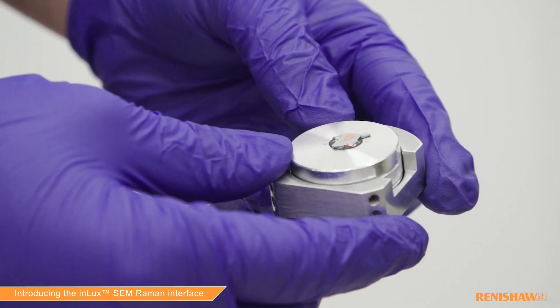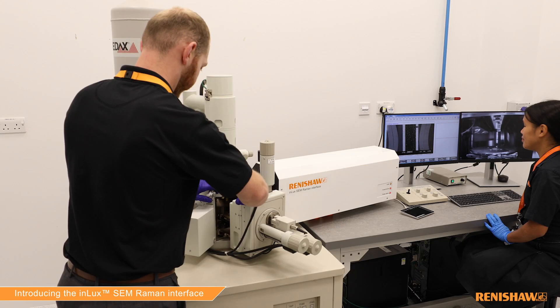SEM gives you your elemental analysis and your topography with very high detail. You can also find out about the chemical identity of your materials.